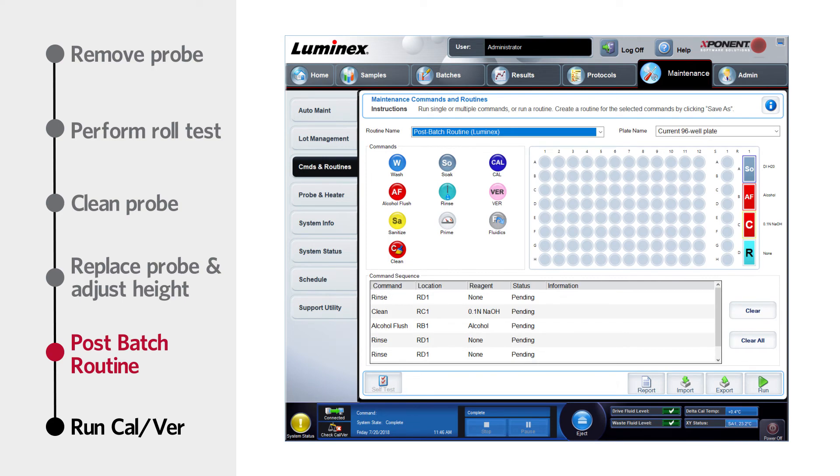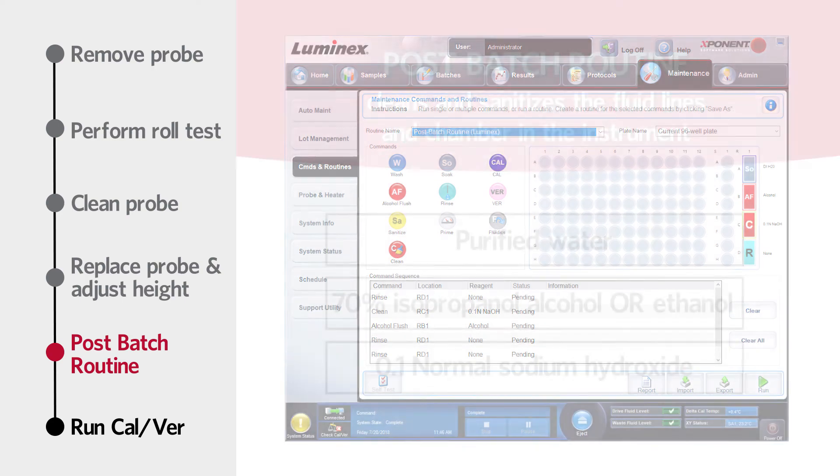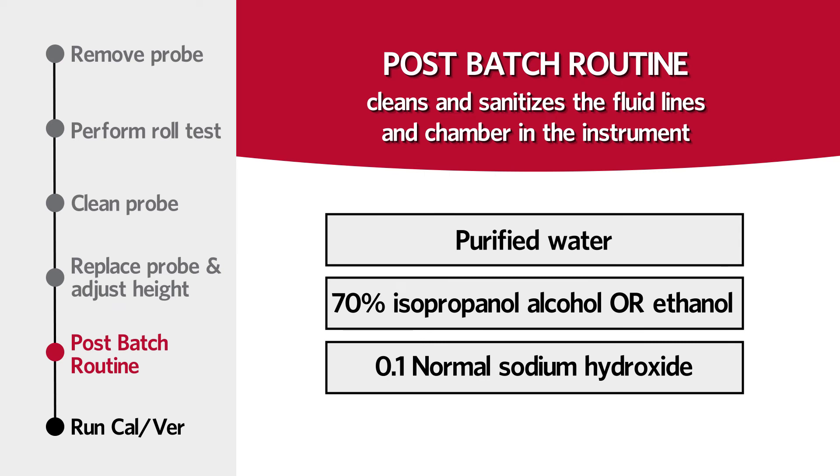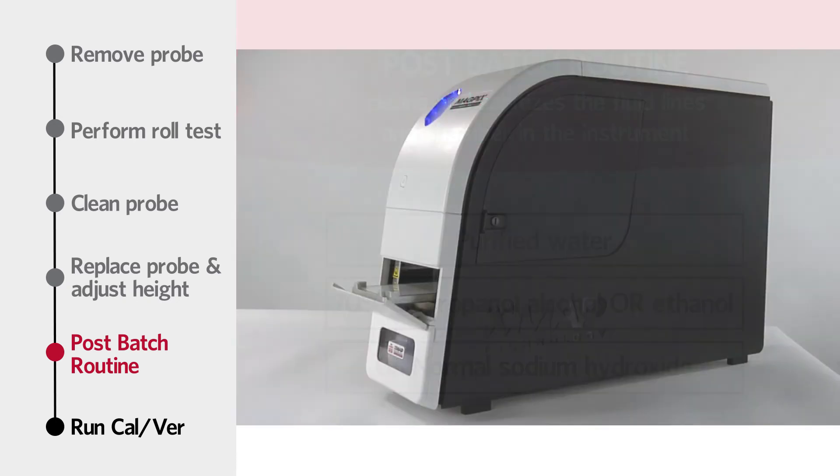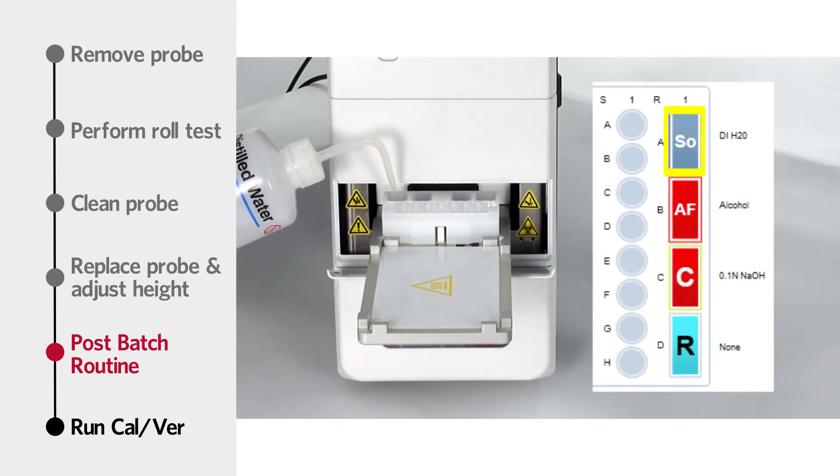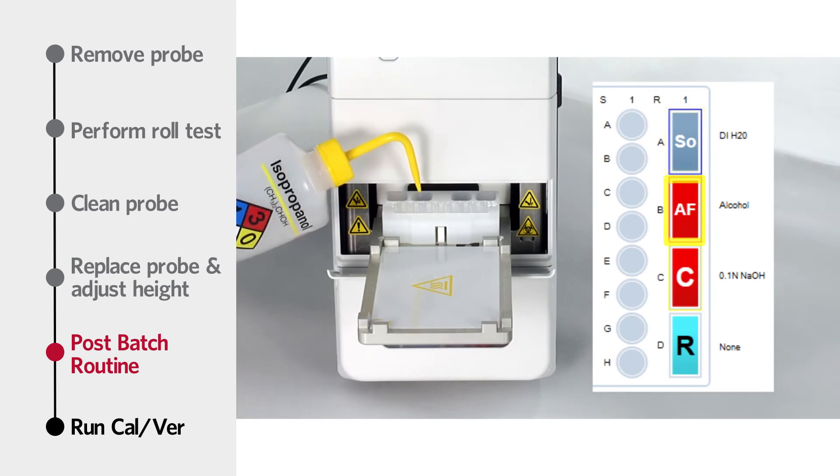Next, run a post-batch routine from the maintenance page, commands and routines tab. This routine will clean and sanitize the fluid lines and chamber in the instrument. You will need purified water, 70% isopropanol alcohol or ethanol, and 0.1 normal sodium hydroxide. Use the plate diagram to fill the off-plate reagent block wells accordingly.